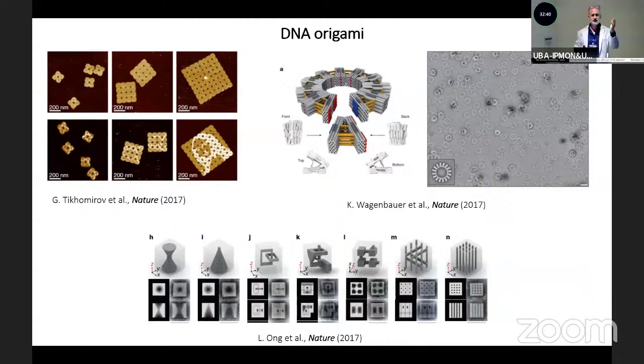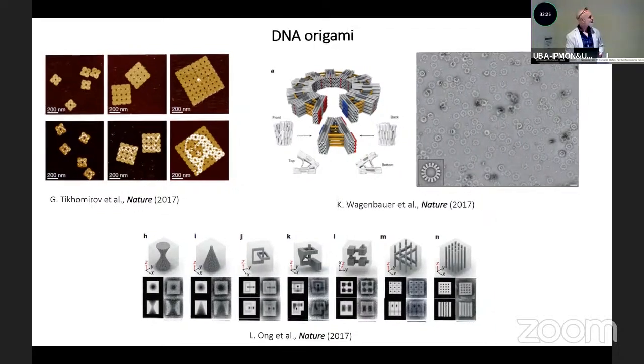You need to see how the DNA origami moves. And these are very small objects. So super resolution microscopy, especially with these very high resolutions that I will show today, is also helpful to check that your DNA origami or other nanomachines are working as expected.